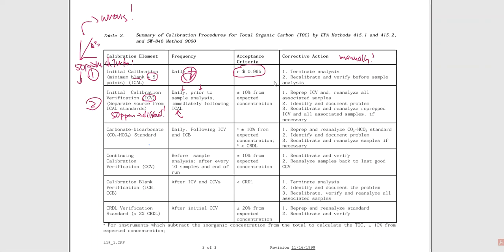So now we're going to look at our ICVs. And when we look at our ICV, we're double checking that calibration curve. I know what I made. Is that the number that's popping out onto the report? I hope it is. I get a 10% window for that.